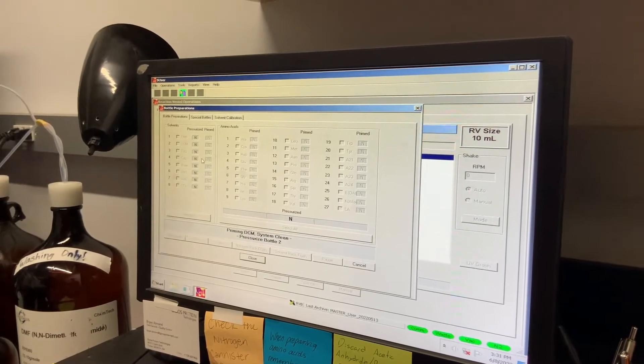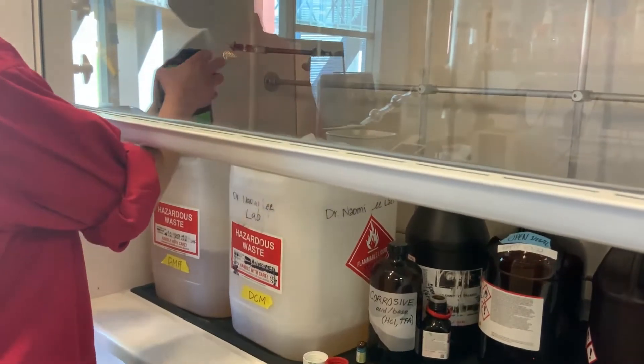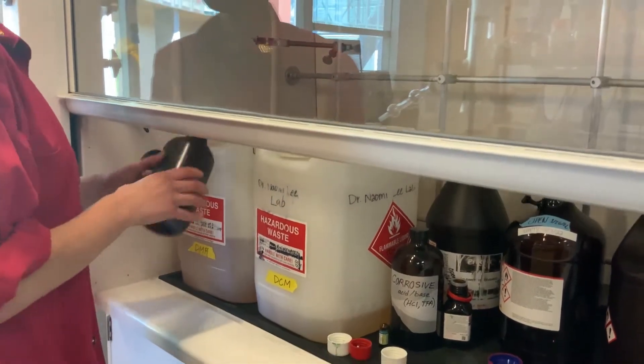While the system clean runs, bring the amino acid, reagent, and solvent bottles into the lab. The capping bottle needs to be dumped, rinsed with water, and allowed to air dry.